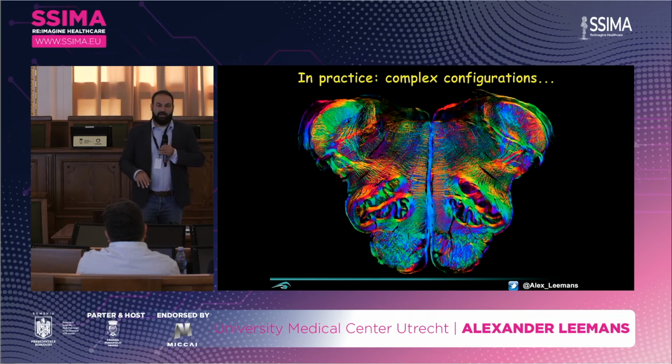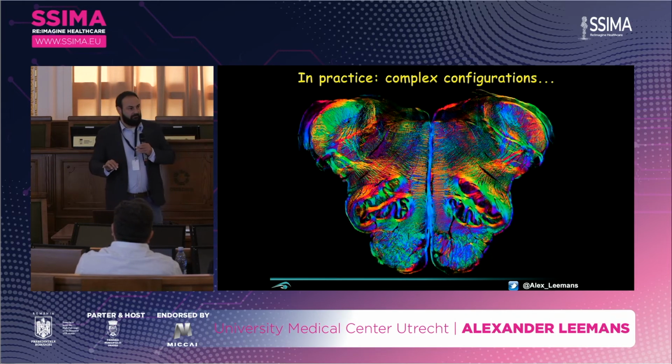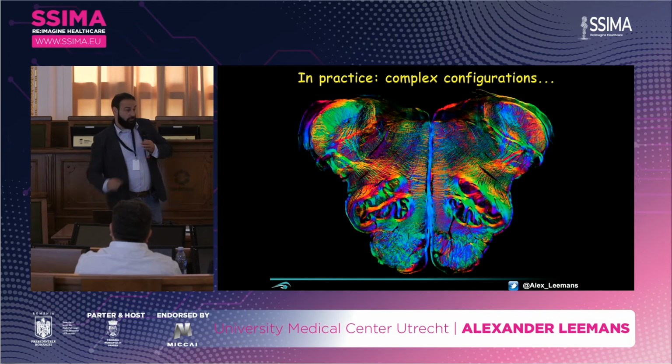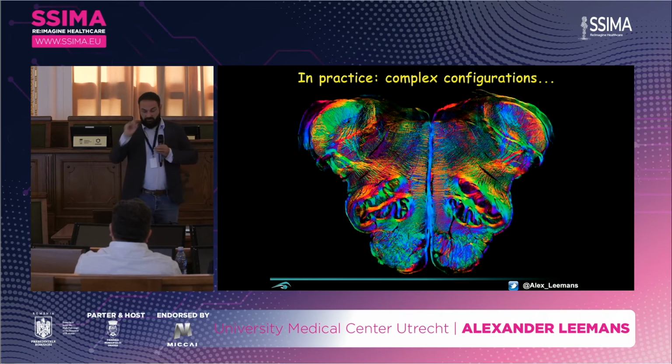This is a polarized light imaging microscopy image. It's an ex vivo technique, so it's not really one of our competitors to look at brain architecture. This is a kind of a microsection near the medulla oblongata. Okay, so in the area of the brainstem. And roughly, it's only this big, very small.